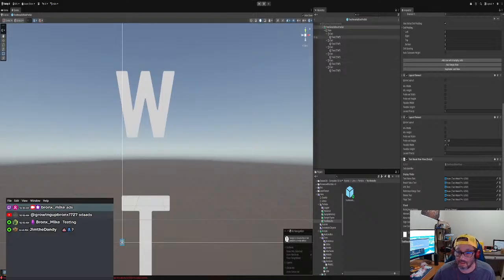All right, so test results row view. All right, and then we just drag and drop.